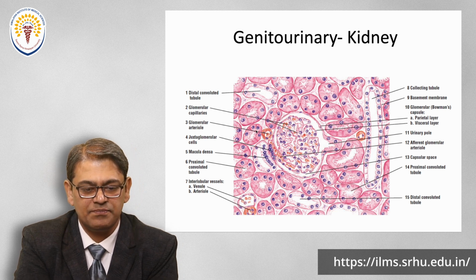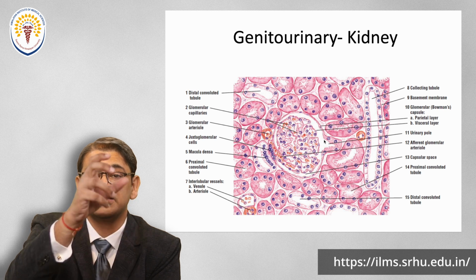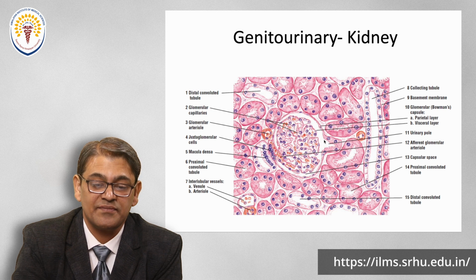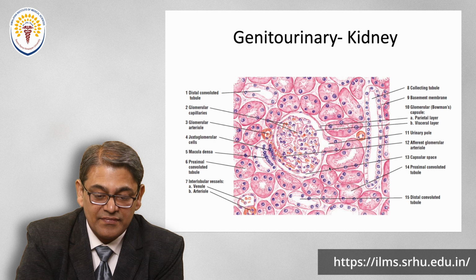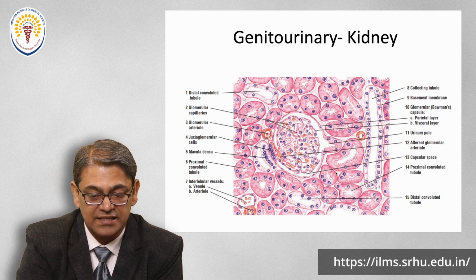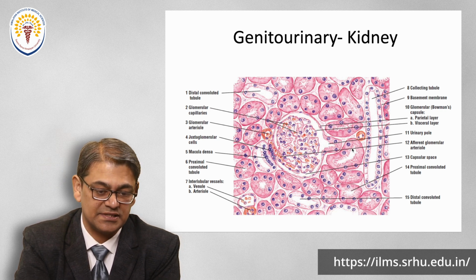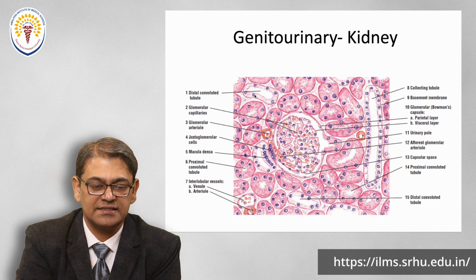Then we see this type of various rounded sections. Do you remember our first class? Remember that video where I gave the example of a tube. If you take a tube section at various places, how does it look? In this video, that knowledge must be applied here. Here we see the lumen inside, with a certain diameter. But here we see a bigger lumen with a bigger diameter. Well, there is another one here where the lumen is bigger and the cells are a little bit lighter.